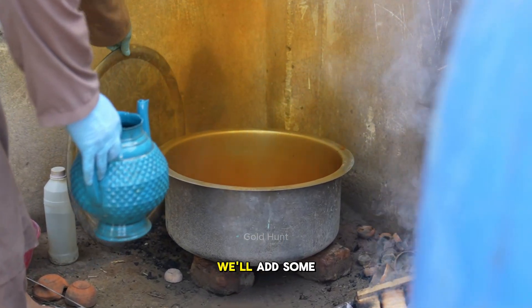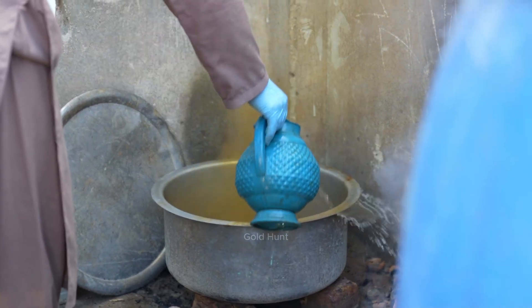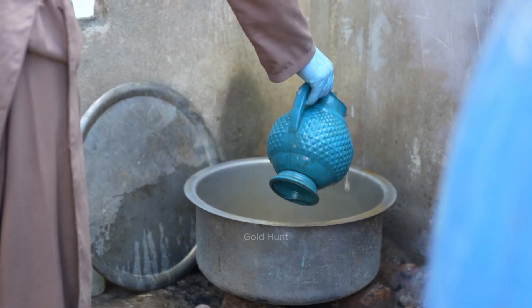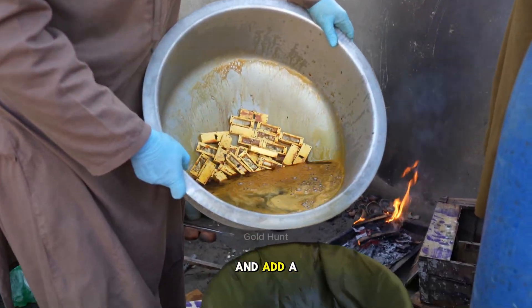After about half an hour, we'll add some water and refresh the acid. We'll pour out the used acid and add a new batch.